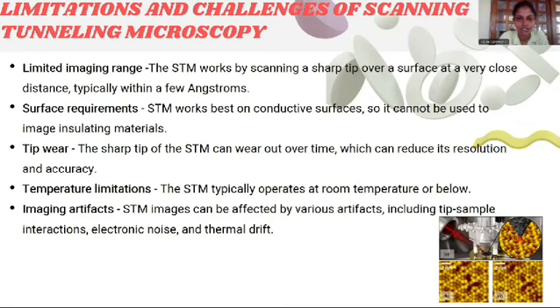Temperature limitations: the scanning tunneling microscope typically operates at room temperature or below. The final one is imaging artifacts. Scanning tunneling microscopy images can be affected by various artifacts, including tip-sample interactions, electron noise, and thermal drift.